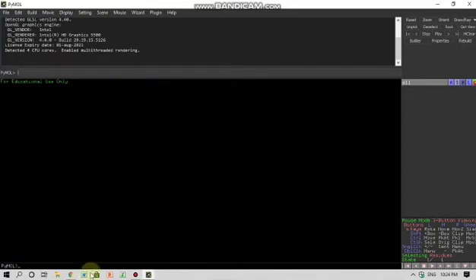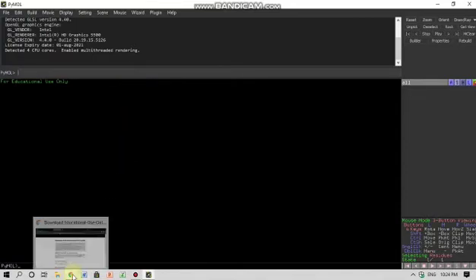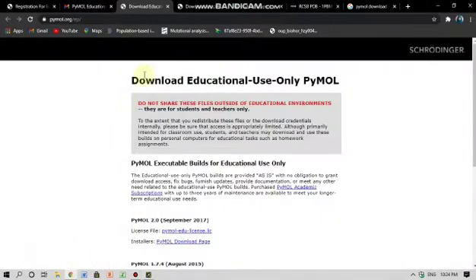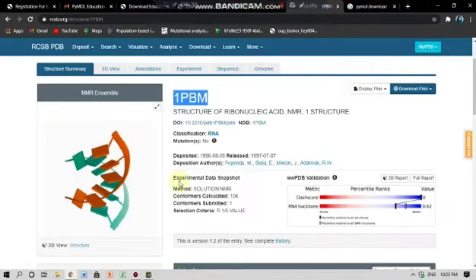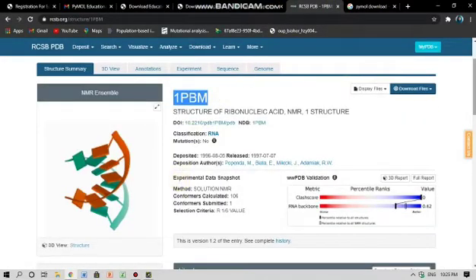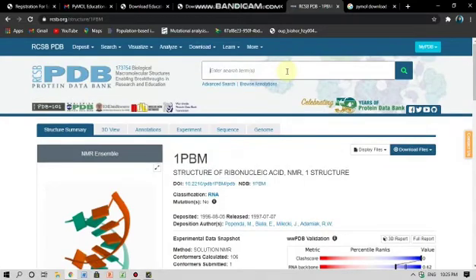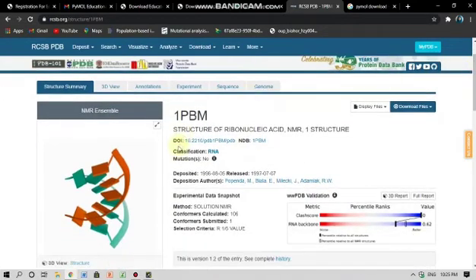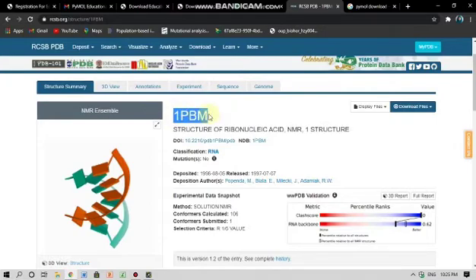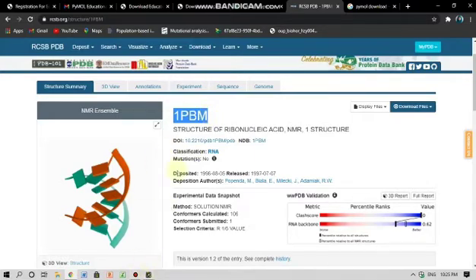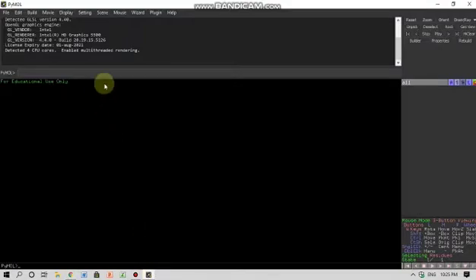Or you can simply fetch the ID number of the particular protein that you want to work on. By fetching I mean that you can go to the PDB website and search for the particular protein here, and they will give you a particular code for that. I'm not now fetching the protein but I'm here fetching the code for the RNA and this is the code for it. Here I can write fetch 1EBM and enter.